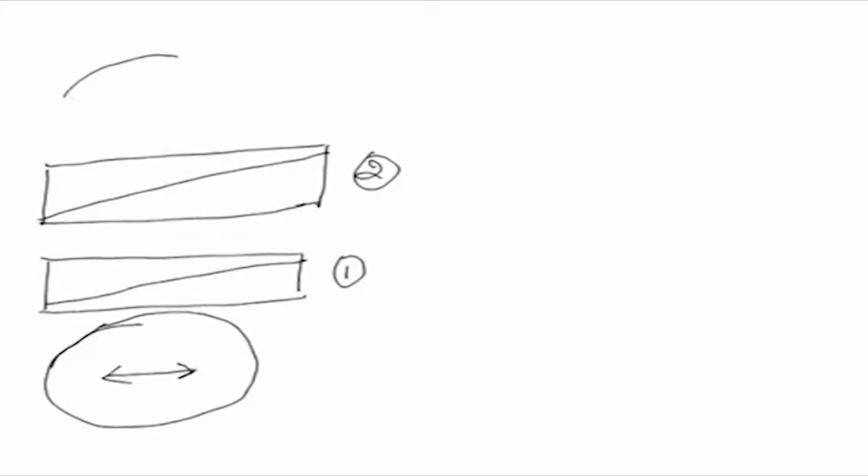Above that you will have another polarizer, which we call the analyzer, and its axis is oriented in a different direction: the first was east west, but this is north south. So this is the arrangement. When the analyzer and polarizer are at 90 degrees, perpendicular to each other, they are called crossed, because any light which passes through the polarizer will not pass through the analyzer.